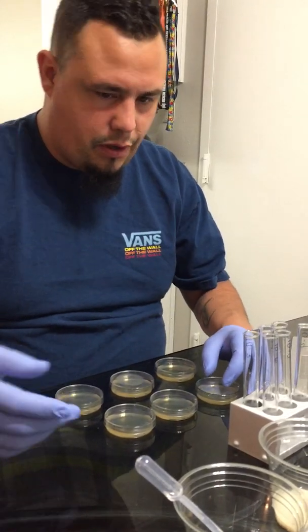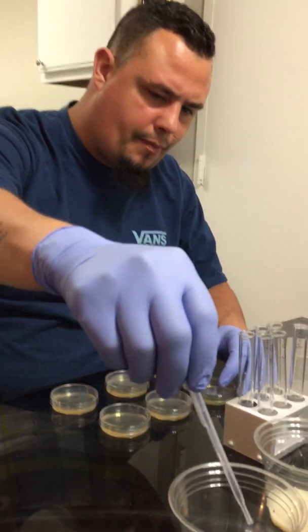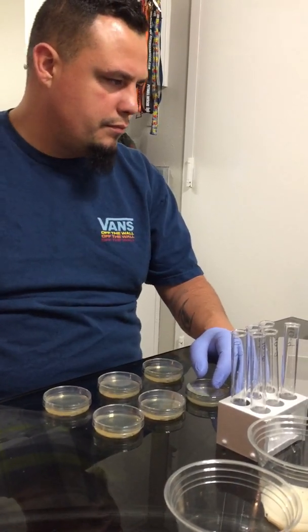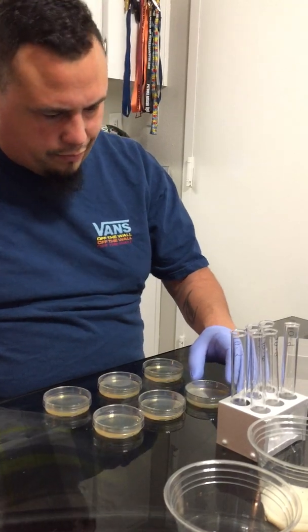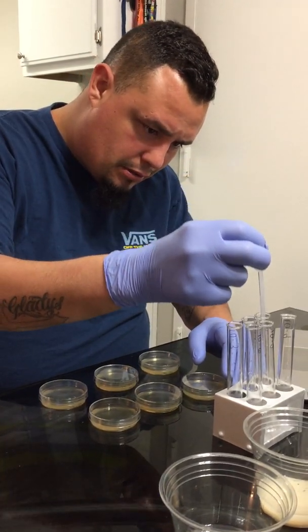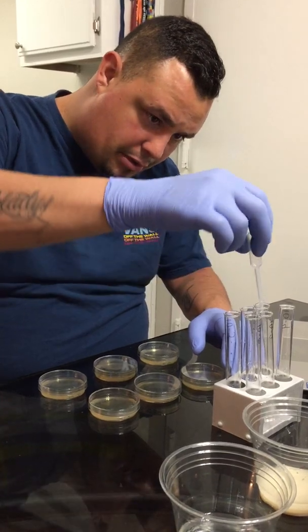Okay, so we're going to go ahead and start. Sterilize the pipette again. We're going to start with number 1. So it calls for about 4 drops. Get a better grip on this.